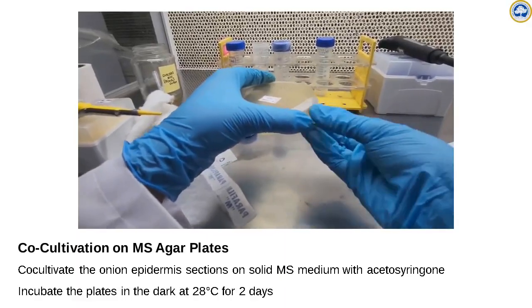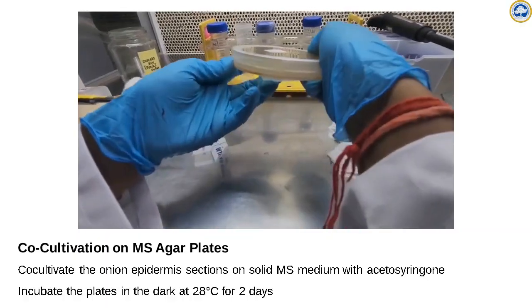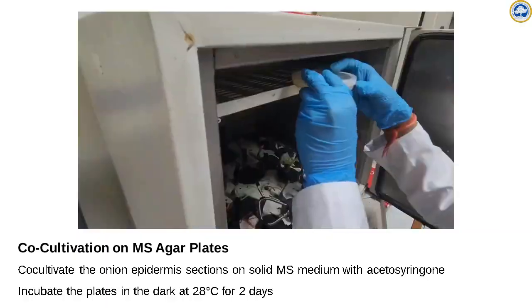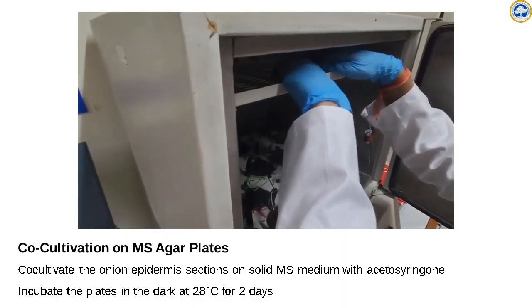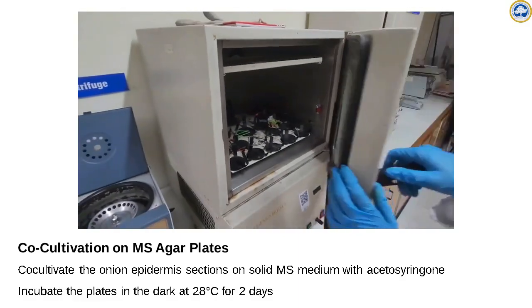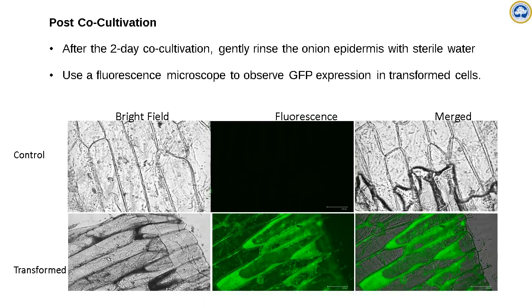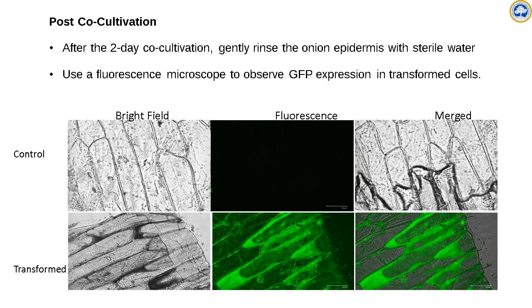So once the co-cultivated discs are ready, we pull out the co-cultivated discs from the plate, and then we visualize the expression of the gene or analyze the expression of the promoter on a fluorescent microscope.